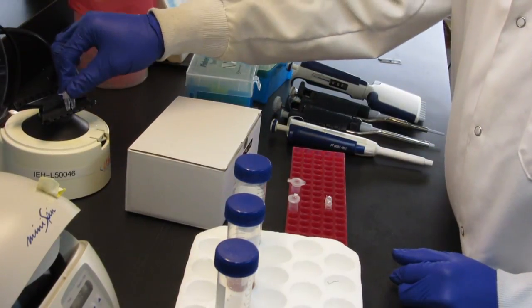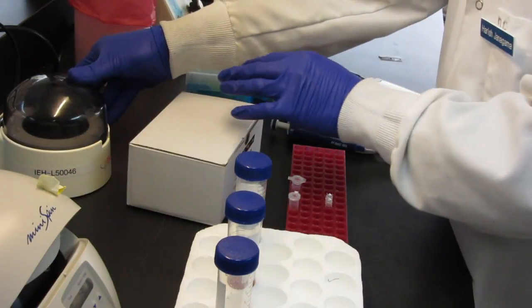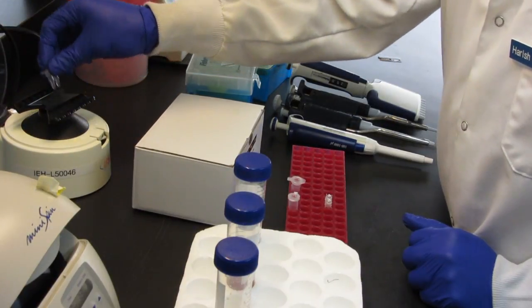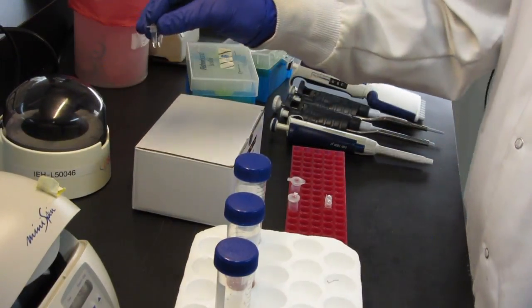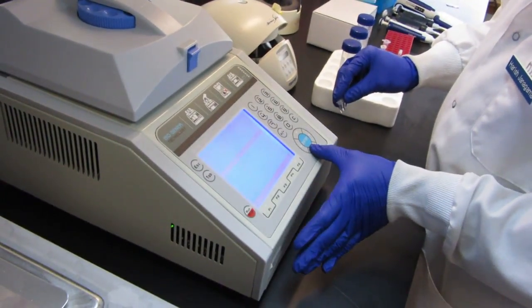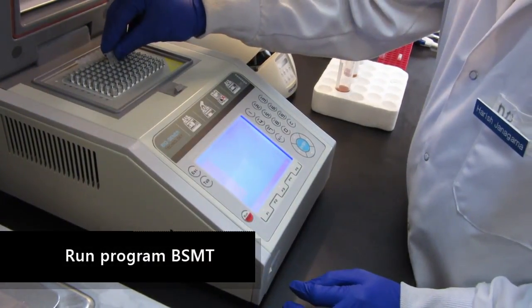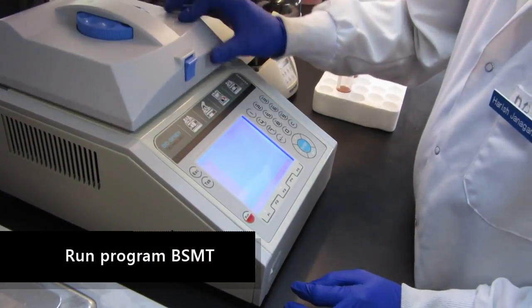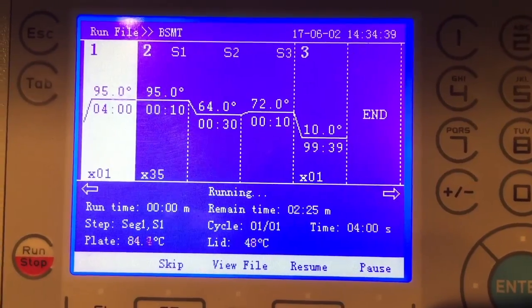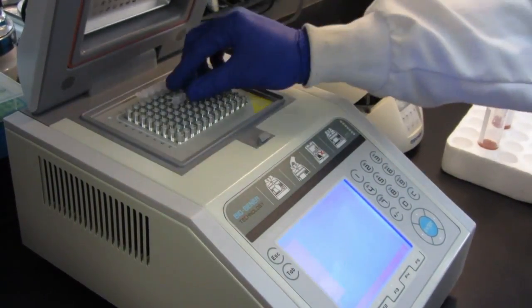Again, briefly centrifuge the tubes to bring all liquid contents to the bottom of the tubes. You will then incubate the sample tubes again in the thermal cycler. You will do this by opening and running the BSMT program in the PCR machine to start the PCR amplification. After the run is finished, stop the program, take your tubes out, and proceed to the amplicon detection step.